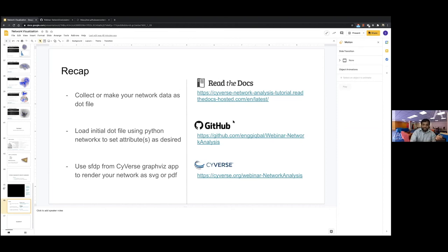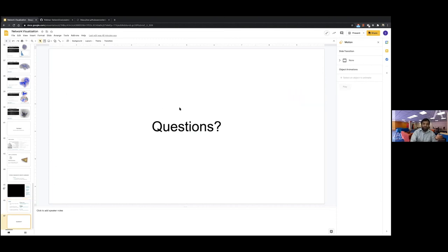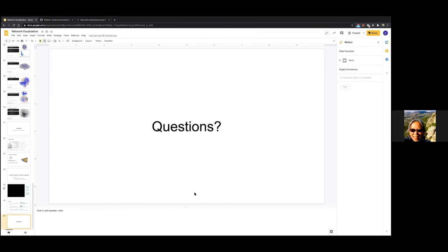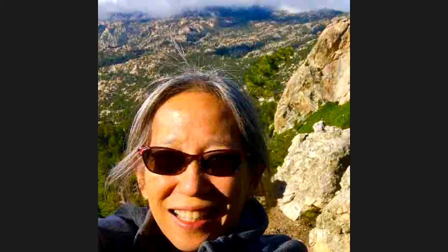To recap: we showed how to manipulate your network data and create a DOT file, how to use SFDP to render your graph, and how to iteratively refine visualizations as PDF or SVG output. This approach avoids the limitations of GUI-based software for large graphs — though you can still extract a subgraph and load it into GUI software for more detailed exploration. Please read our tutorial and check our GitHub repository.